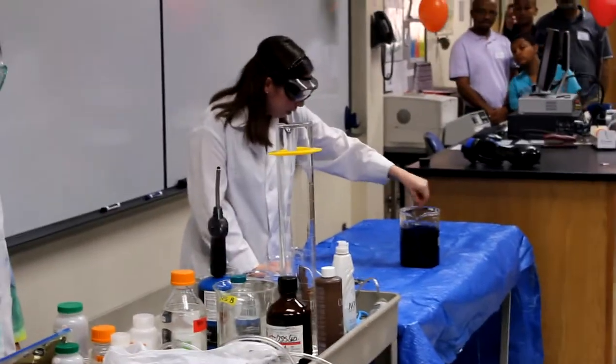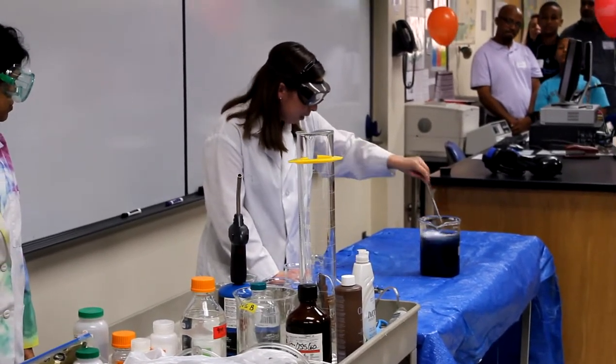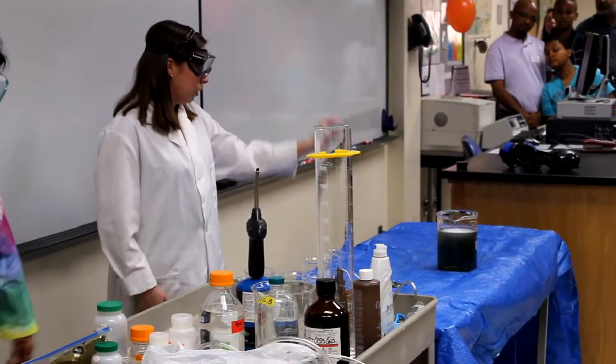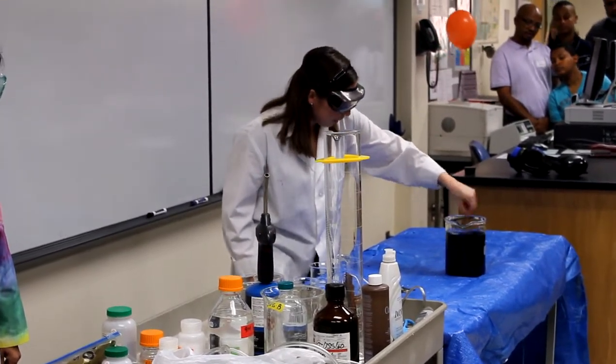We made these yesterday, and sometimes that makes them a little bit slow. But what it does is it's a reaction that just keeps going back and forth. Or supposed to.